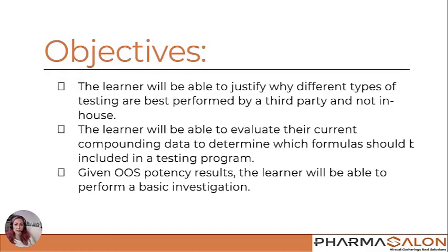Let's review our objectives. At the end of this lesson, you'll be able to justify why different types of testing are best performed by a third party and not in-house. You'll be able to evaluate your current compounding data to determine which formulas should be included in your testing program. And if you get out of specification potency results, you will be able to perform a basic investigation.